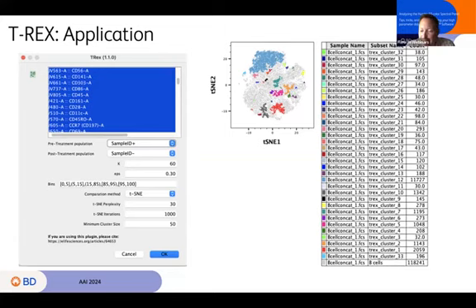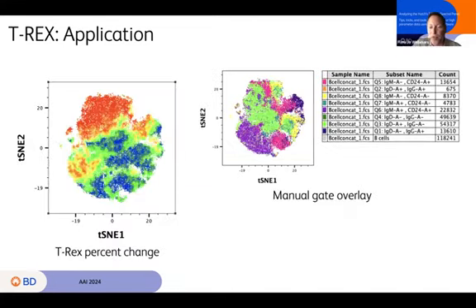And if I said that and you're thinking, well, that feels fairly unsatisfying, just the difference in B cells. Well, what is the difference? What kind of B cells are different, are overexpressed or underexpressed? That takes us to our next tool.